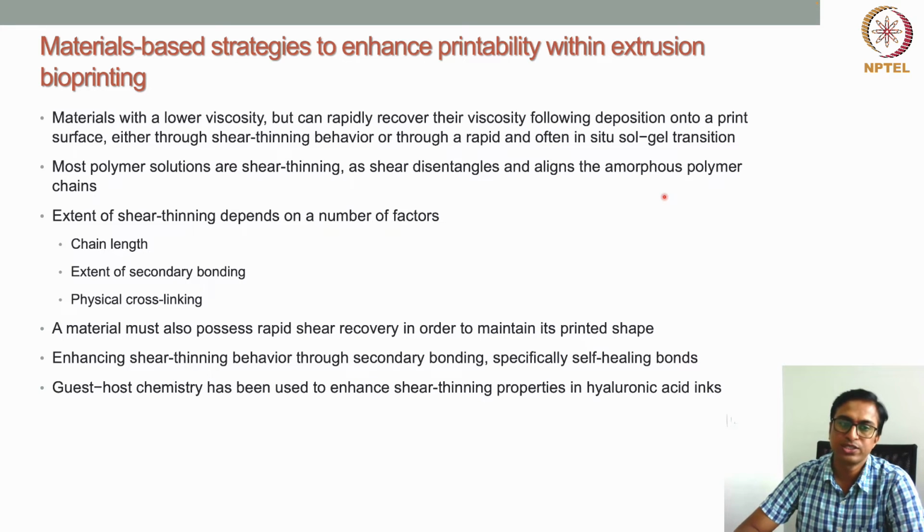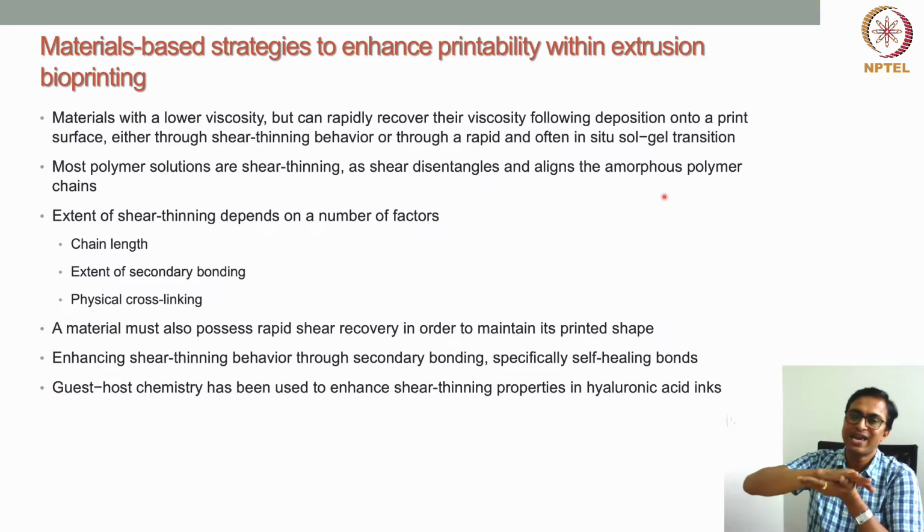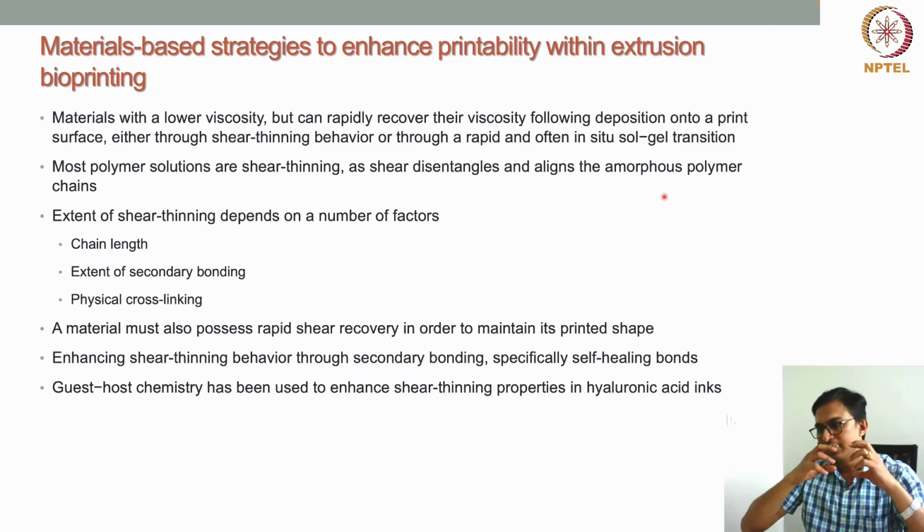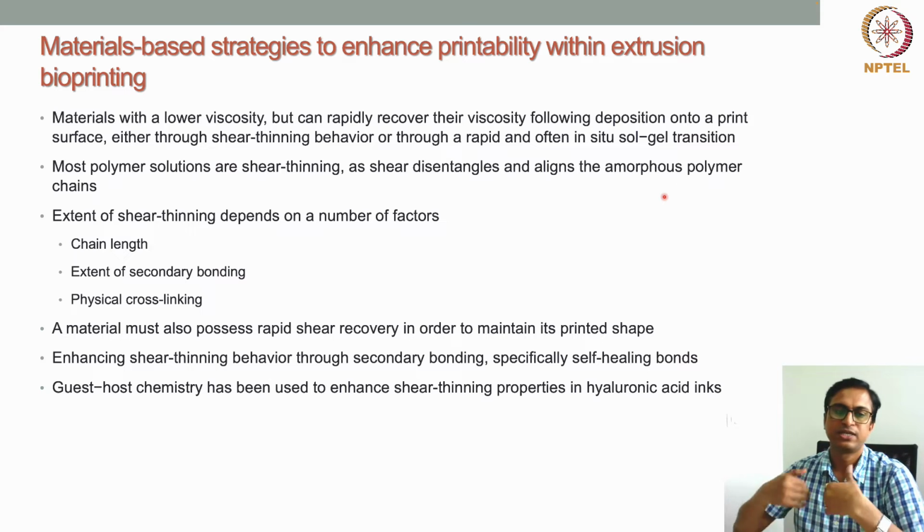That also leads to a high shear thinning property, because the shear force can disrupt that secondary bonding and decrease the viscosity of the material.